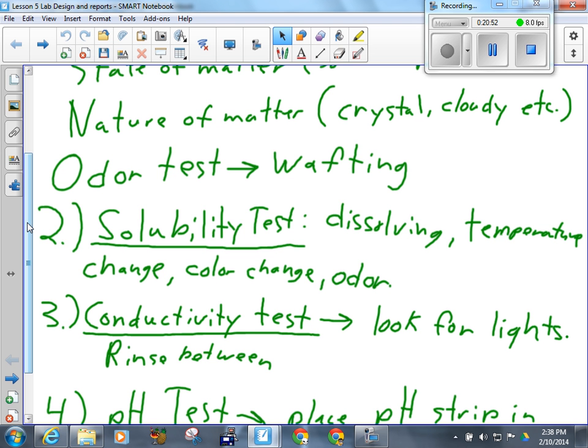So what we're doing here, guys, and it looks like there was actually still stuff in this one, but if we use distilled water, distilled water has a very poor conductivity, right? And there was still a little bit of stuff in this depression plate, so it's reading a conductivity of 3. Pure distilled water with no contaminants, 0. Pure distilled water does not conduct electricity because it's molecular. All right, everyone with me on that? If I add an ionic compound to that, let's just say we've got some salt here. If I add a little bit of ionic compound to that, and again, it doesn't take very much.